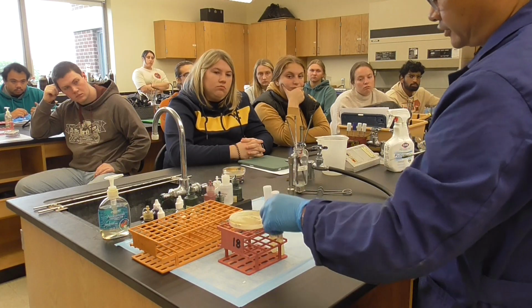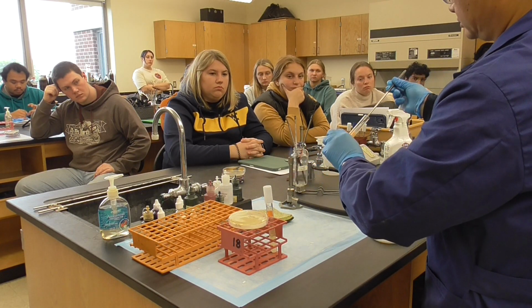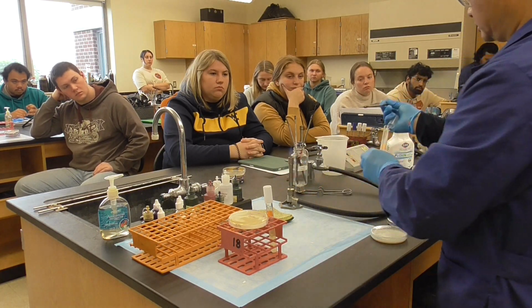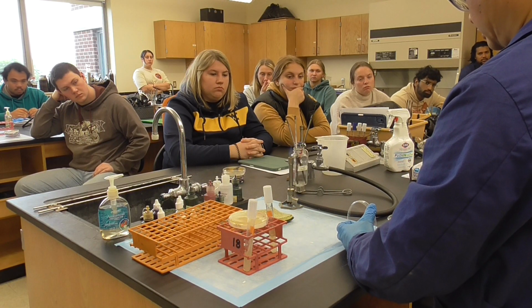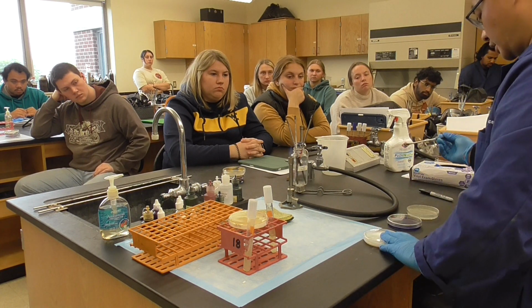Okay, we're going to do E. coli first. Flame the loop. Gently pick bacteria and put it on the side. Which side is E. coli? This side is E. coli. So very gentle. That's all. E. coli is right here.